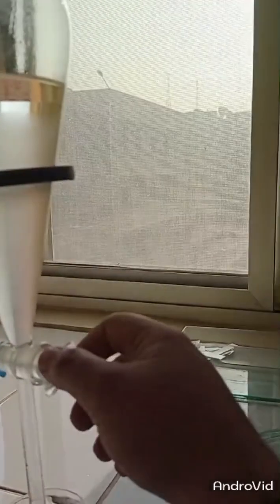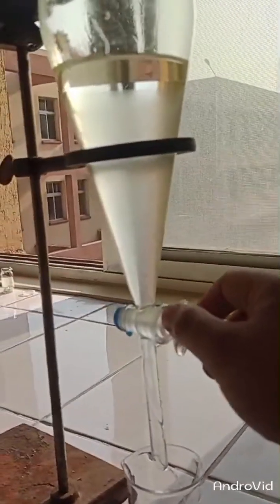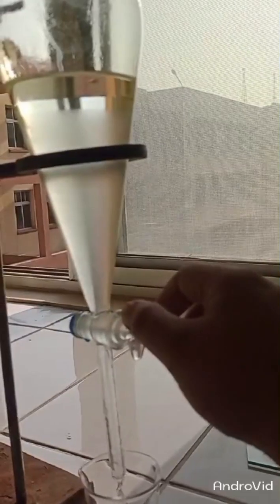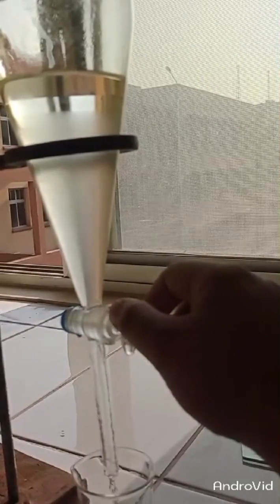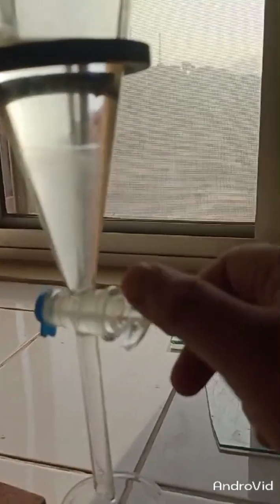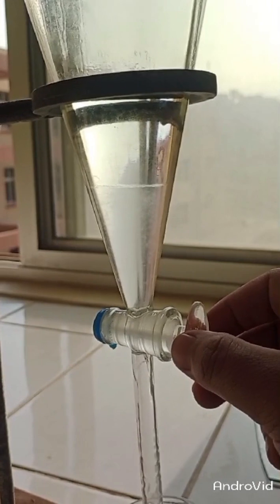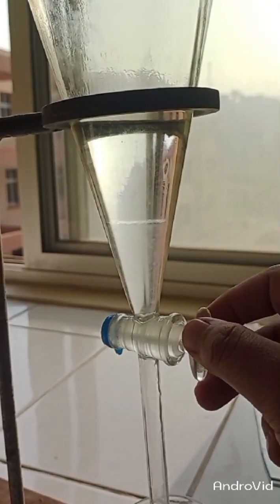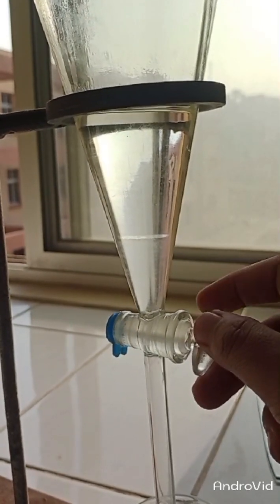Now it's time to separate our layers. First, I will collect my aqueous layer from the lower surface by opening this cork. We are separating the aqueous and organic layers, so be careful that your organic layer should not pour out from the downward opening.